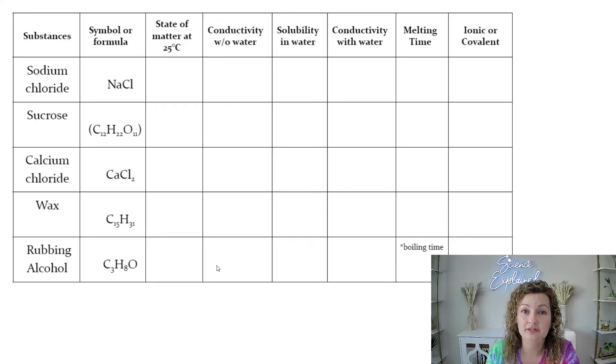Notice we are testing five different substances. We have sodium chloride, sucrose, calcium chloride, wax, and rubbing alcohol. We're just going to use isopropyl alcohol today.